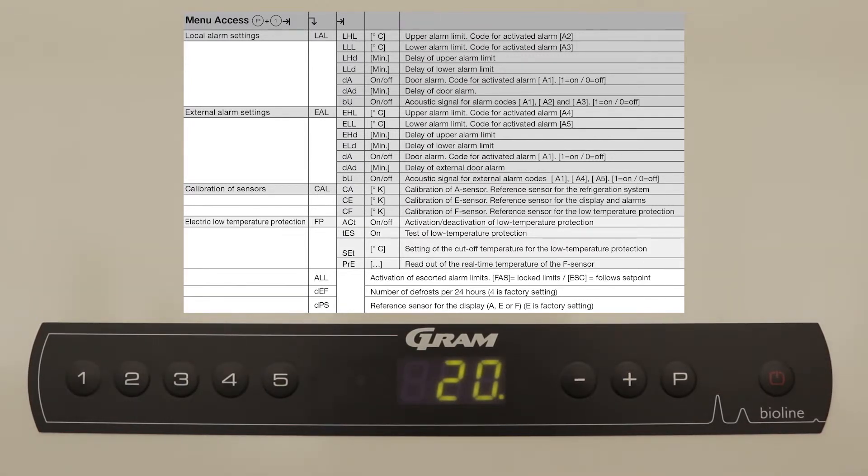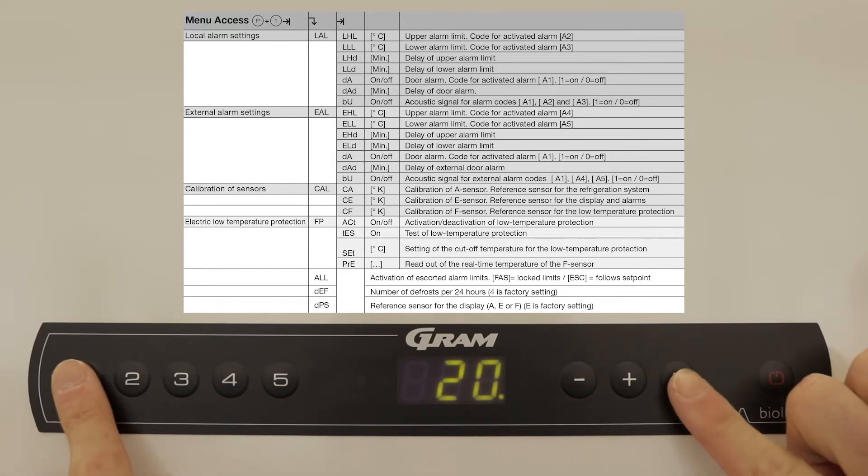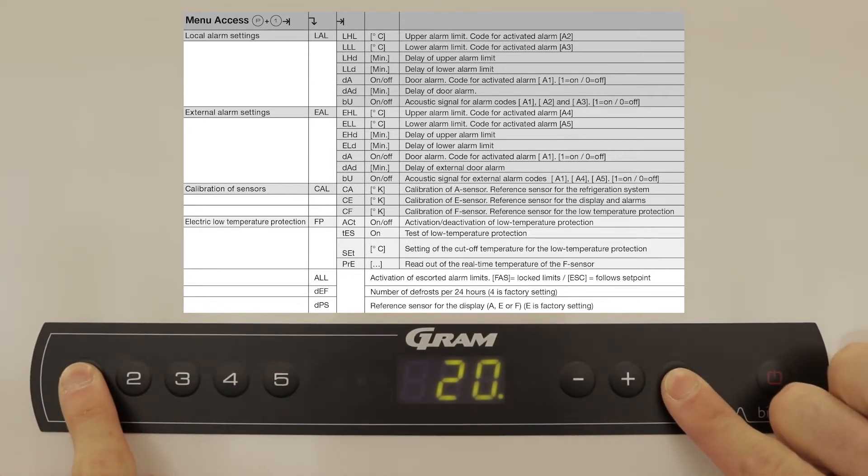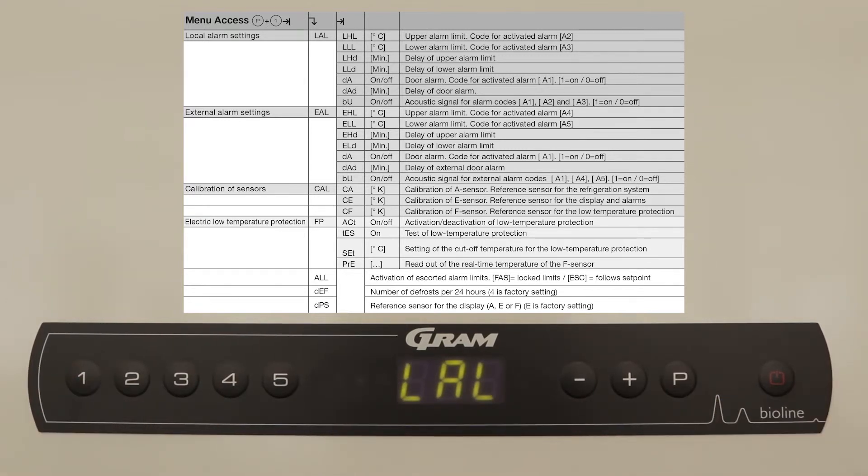We will be concentrating on the standard setup of the local and external alarm settings. Open the menu by pressing and holding P and 1 together for 3 seconds. Navigate to local alarm settings and press P to select.